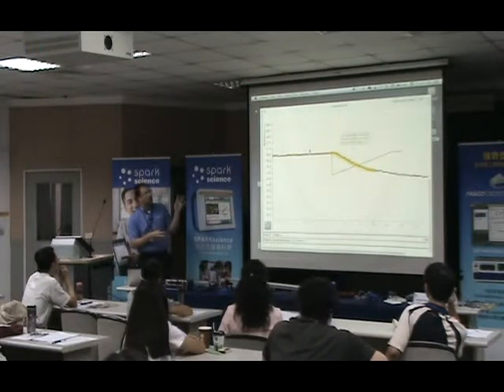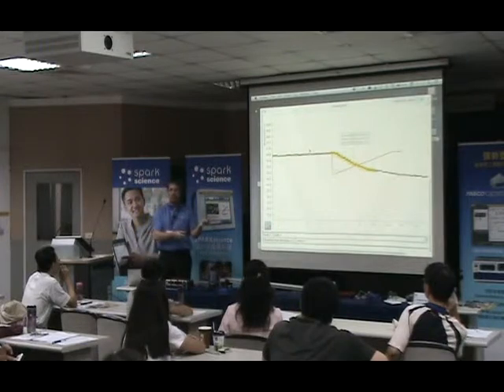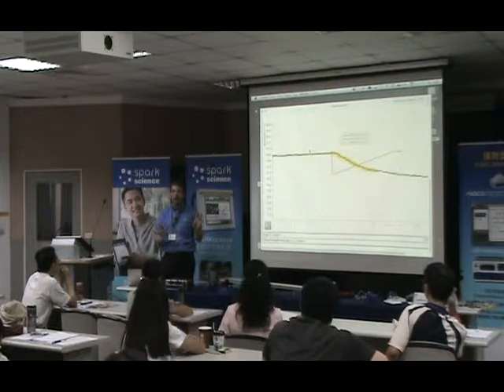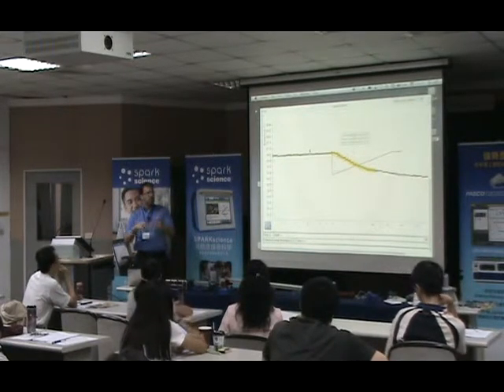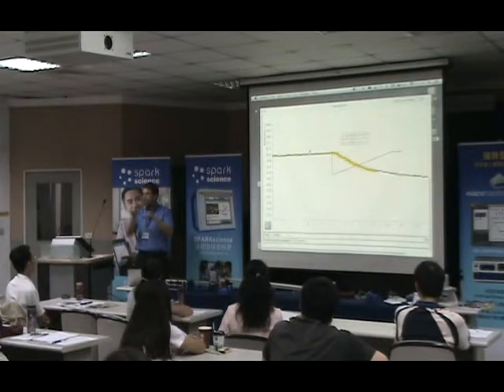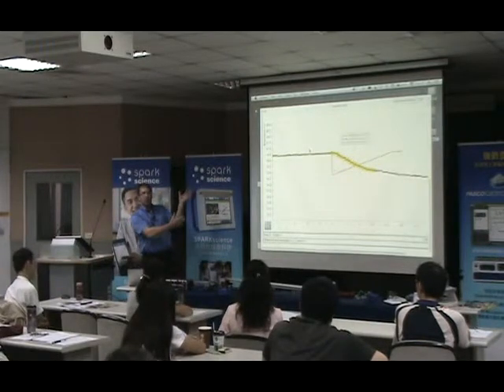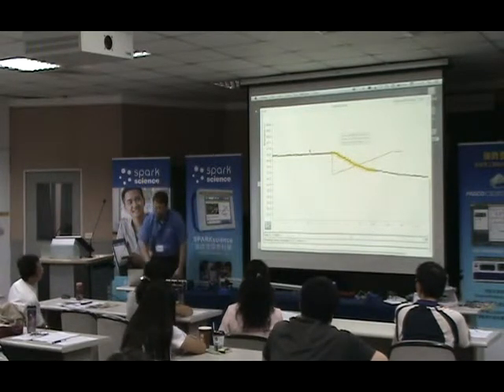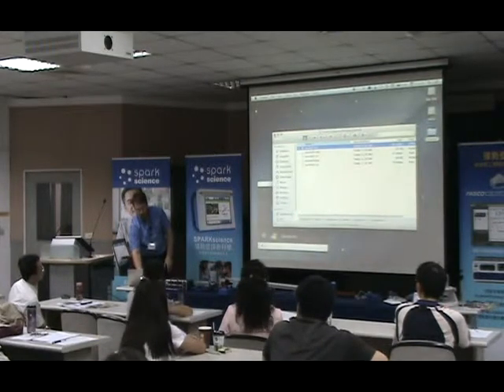And the reason why we chose HTML, one is there's not a computer or electronics device nowadays that doesn't have a web browser on it. So if the students were to email this, the teacher would be able to open this up no matter if they had SparkView running or not. Right? The other reason is because this opens up very easily inside of Microsoft Word. So the students could open this up inside of Word, finish formatting their lab report, and now they have something that they can deliver to the teacher, showing them what they've learned in that lesson for the day. Once students finish, they can email it to the teacher, who can look at it, discuss it with them, or do some other follow-up work. All right.